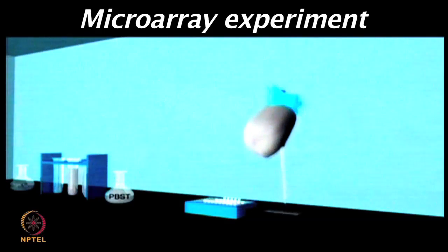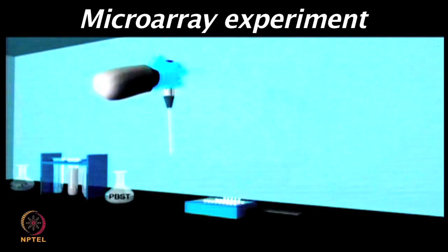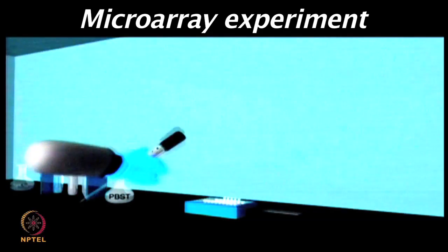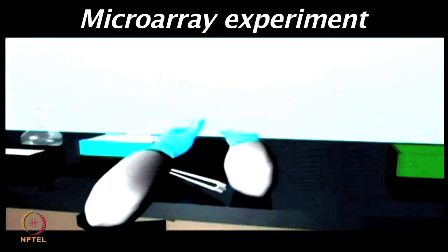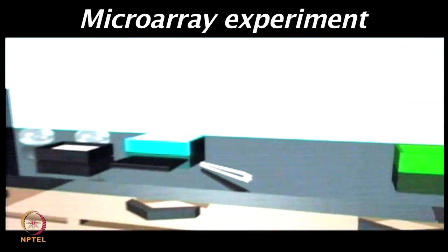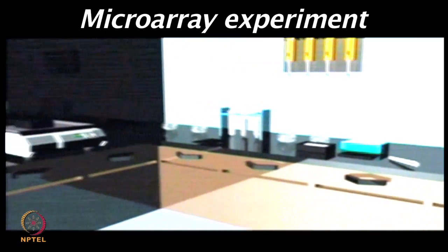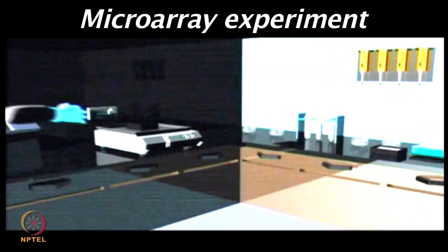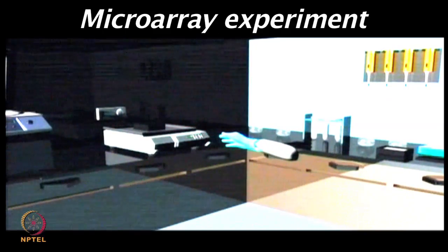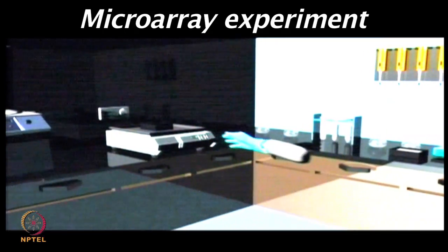One is that if you are allowing the serum a long time, it is possible that it is going to give enough time for identifying the right targets. On the other hand, if you are allowing it very long, for example, overnight incubation, it is possible that background will become very high. So, people try different types of conditions in the labs, and then they apply serum or primary antibody and adjust the times for the incubation accordingly.